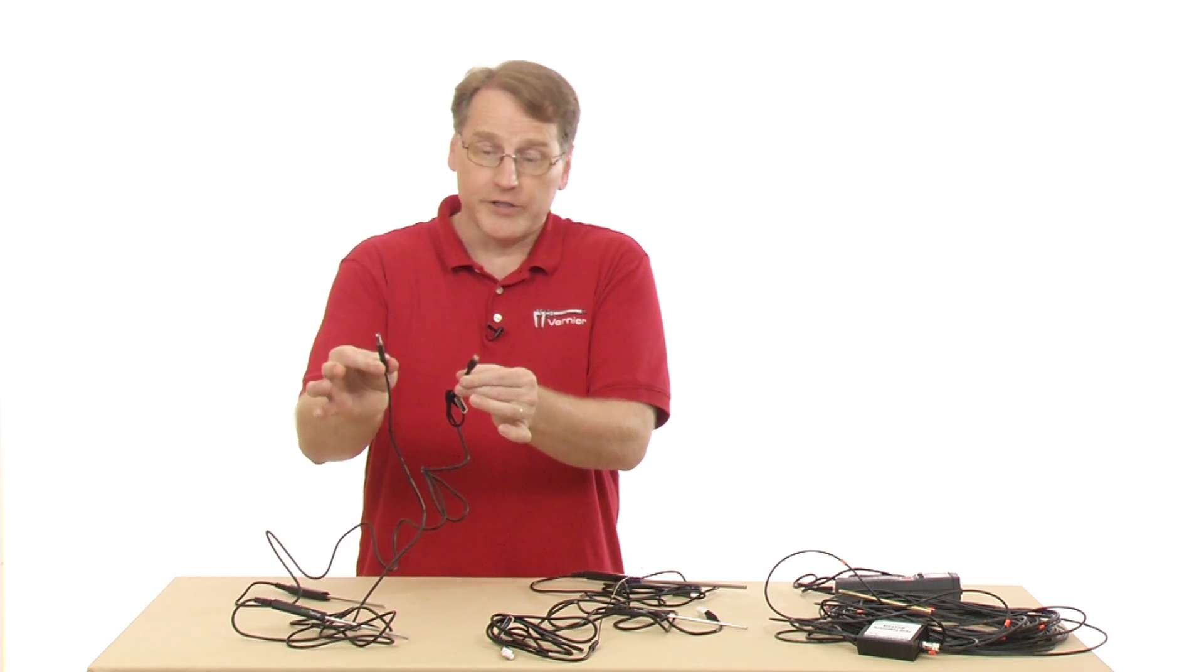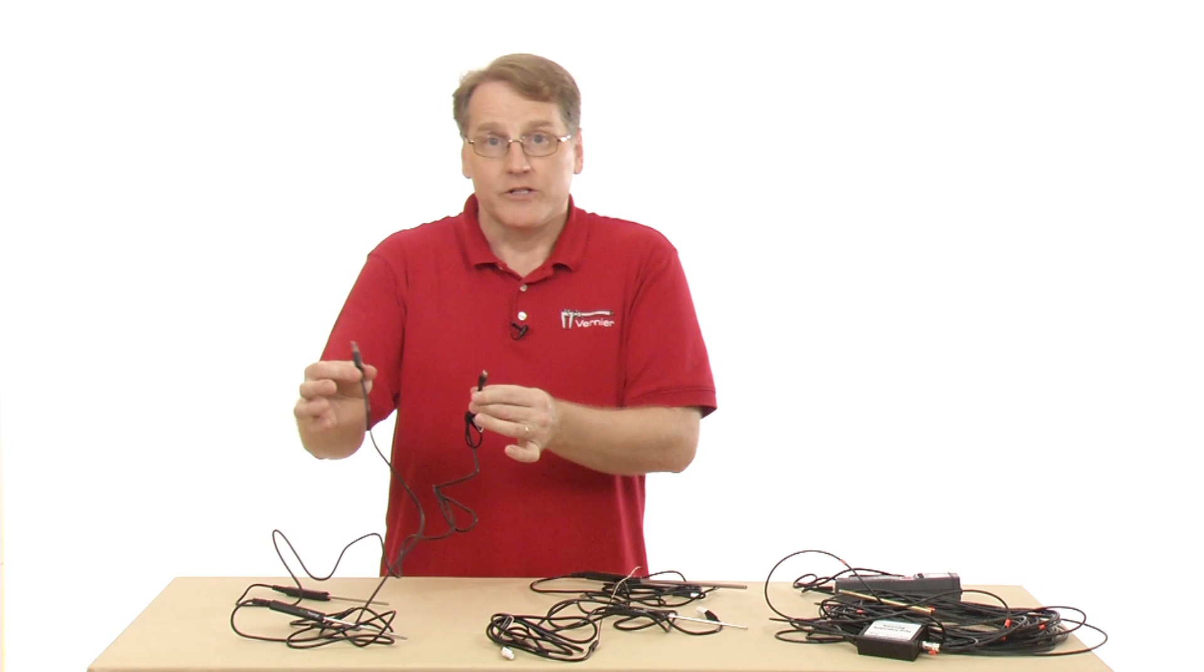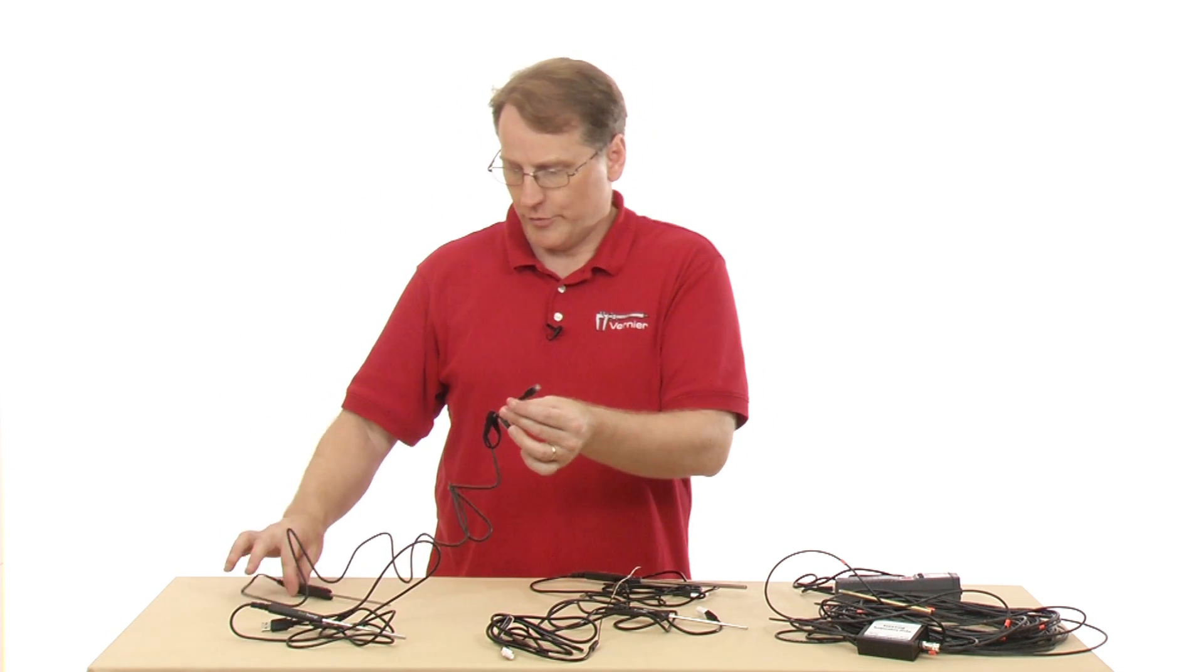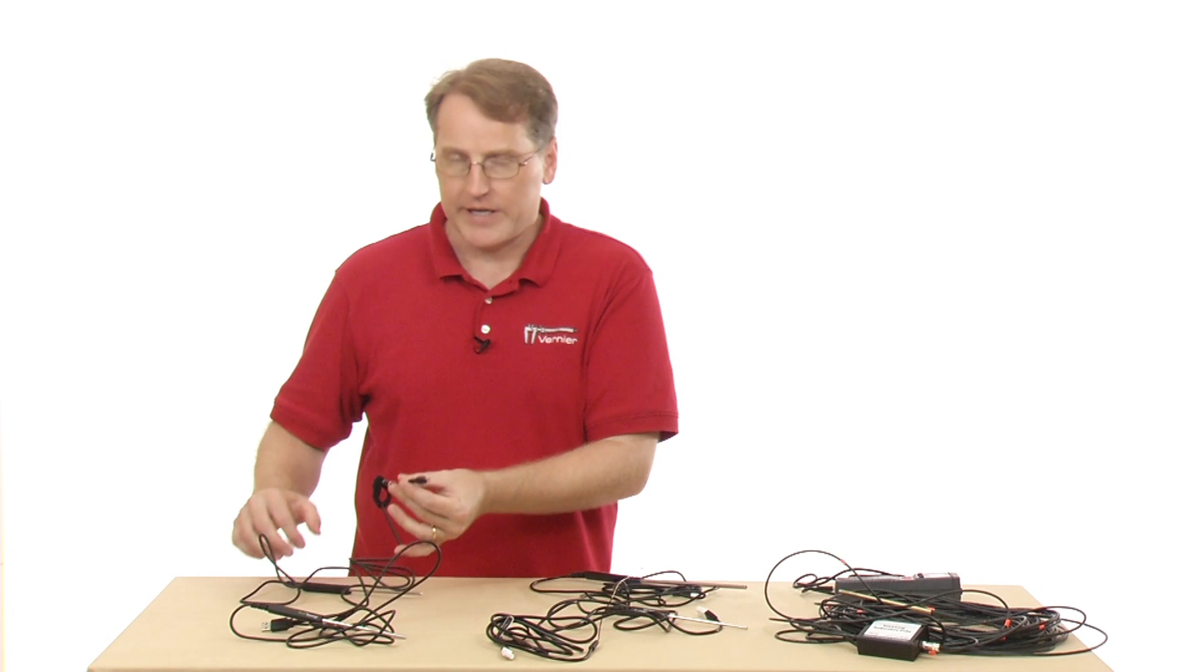And so it's really just the difference in the size of that. So depending on what device you have, if you have a TI device, you probably would go with the EasyTemp for that.